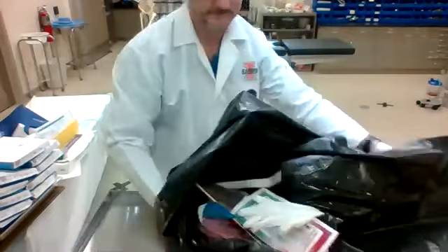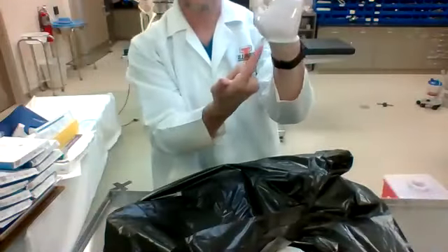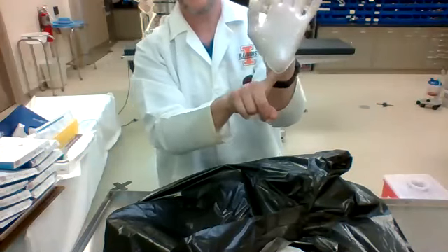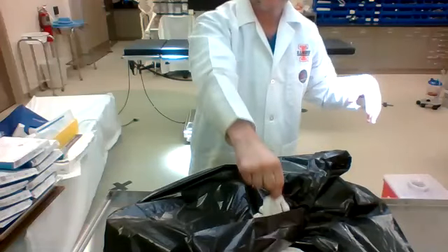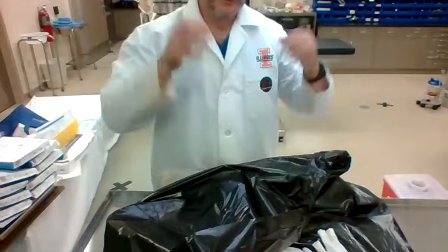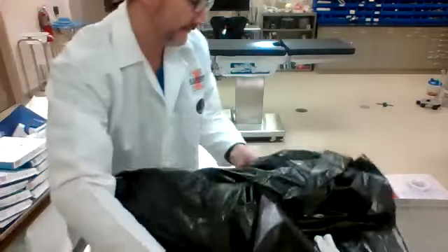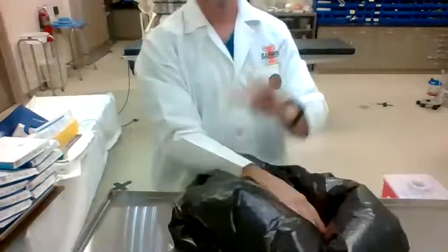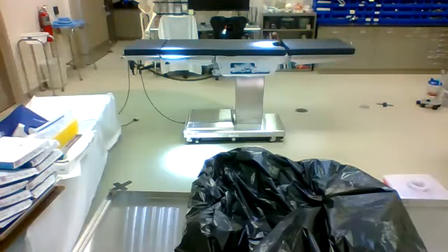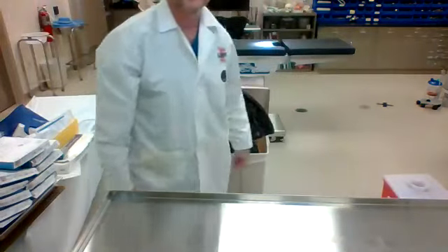And rolling. Perfect. About halfway done. Take my finger under. If you didn't catch that, put my finger against my wrist and I slid it underneath, wiggled it. Hold it off. Oops. Tuck in the bag. You can take your apron off. You can take your goggles off. Throw them all in the bag. Everything out here now is clean. So I'm just going to roll all this stuff underneath. Somebody else's problem now.